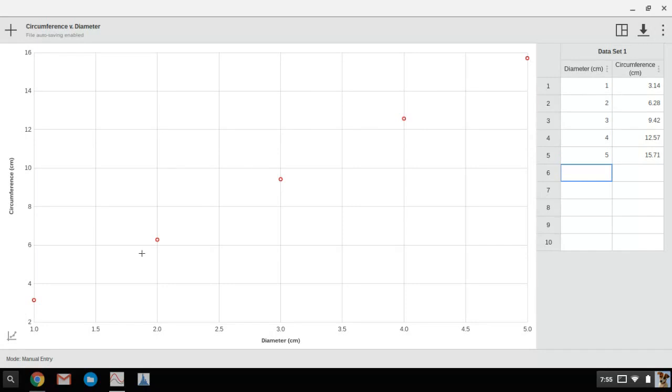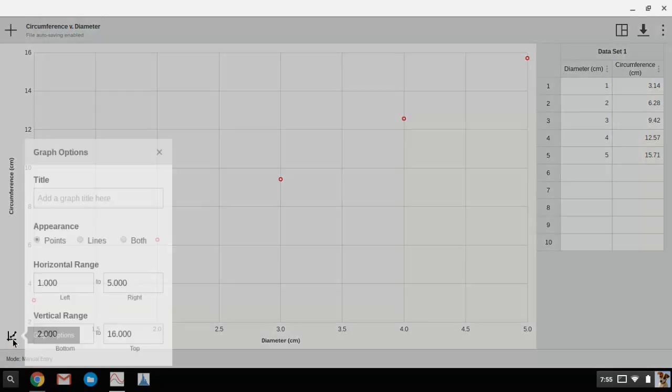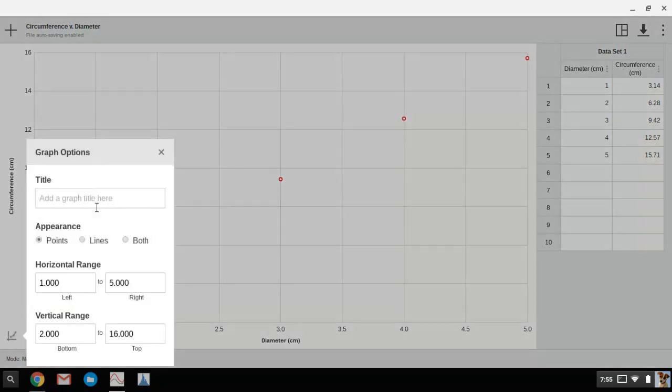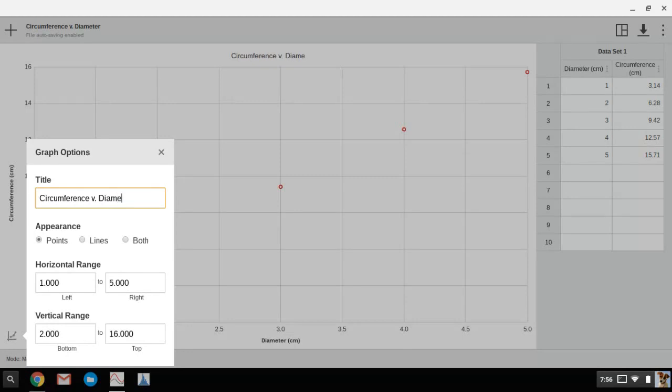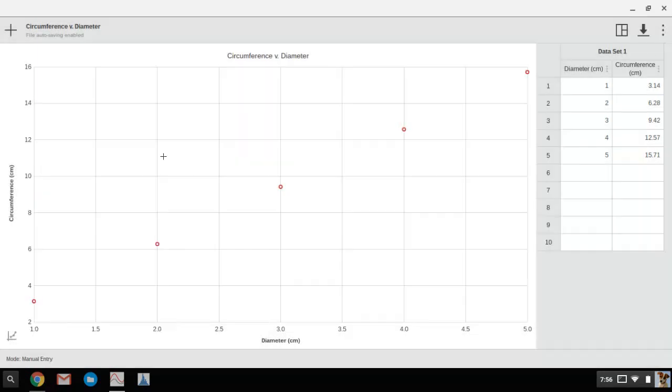So I go down to graph options, click on that, and I can name this the same thing that I named the experiment: circumference versus diameter. Close that. Now I've got a title at the top.